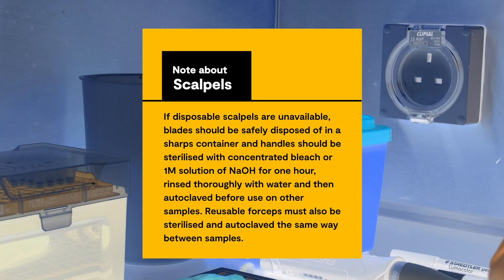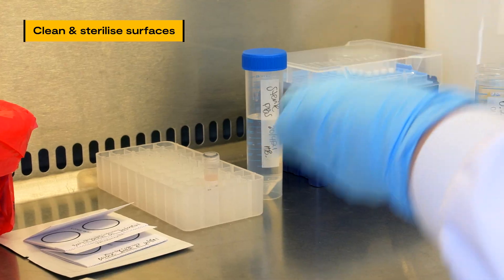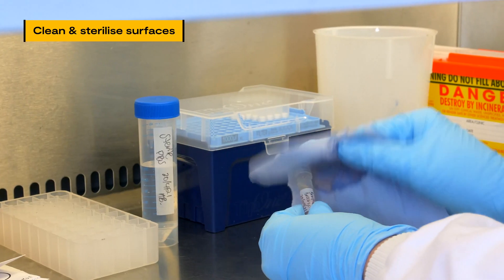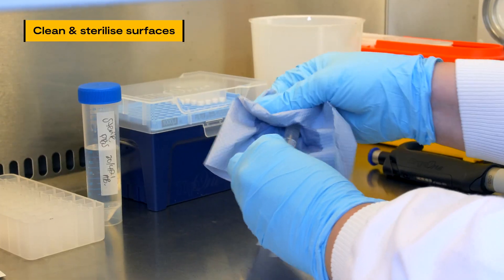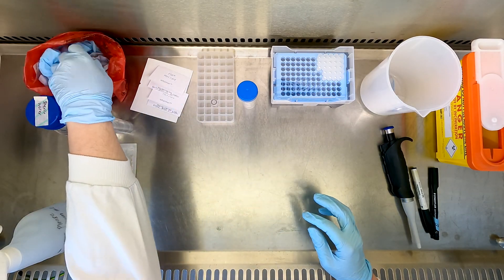Reusable forceps must also be sterilized and autoclaved the same way between samples. Between samples and before moving on to the next step of the protocol, work surfaces, materials and the outsides of individual vials must be cleaned and sterilized with 0.2% bleach or sodium hydroxide to prevent cross-contamination. Use sterilized water to remove leftover bleach and sodium hydroxide residue after cleaning, and change outer gloves before beginning the next sample or homogenization step.